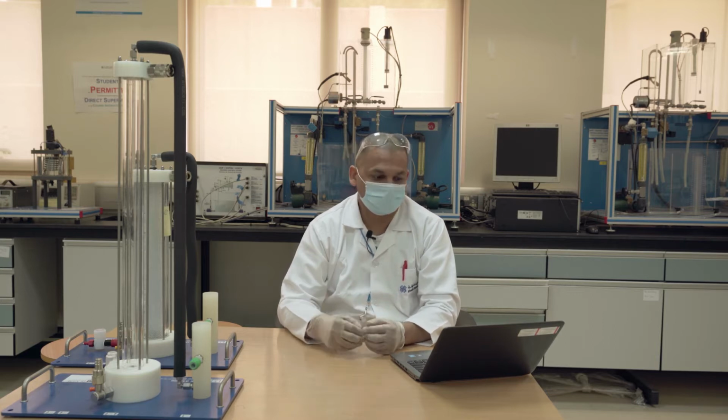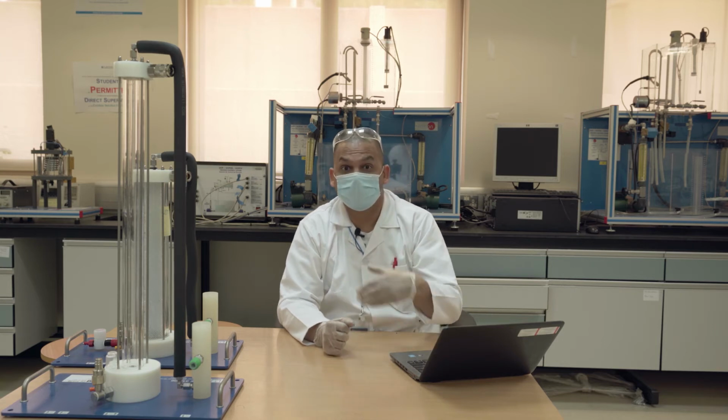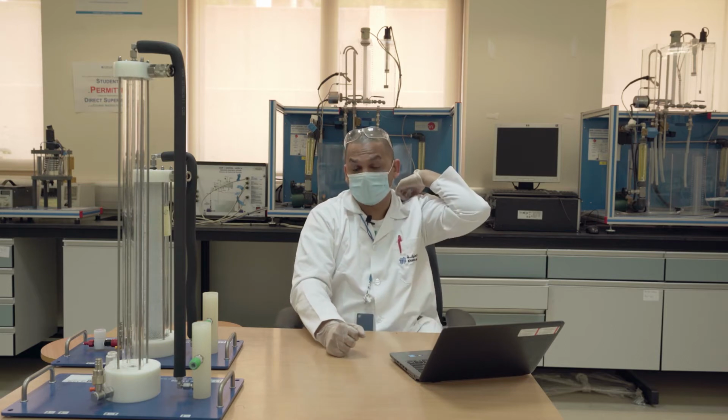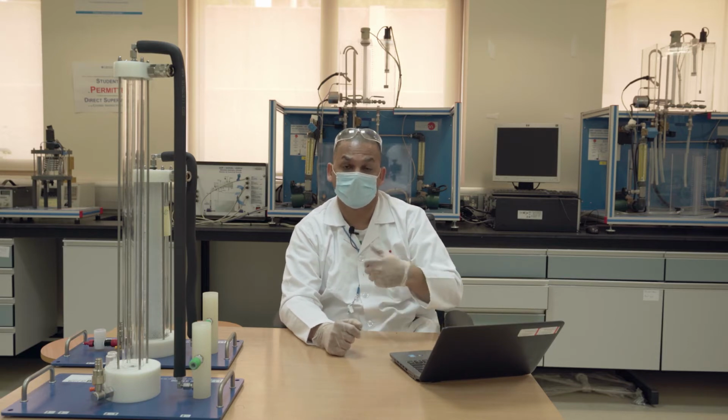So first thing I need to ask the question, what is the objective? The objective of this lab is to train the student to identify, plan and design any experiment that they need to find out the kinetic parameters. Kinetic parameters are usually the order of reaction, the rate constant, the activation energy, and their values.